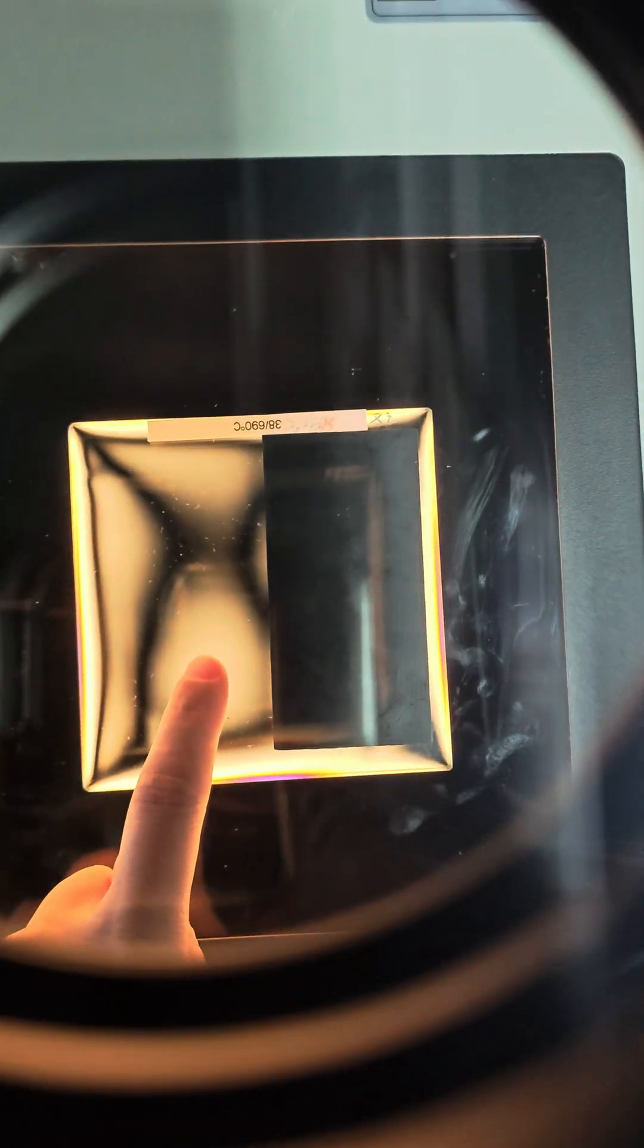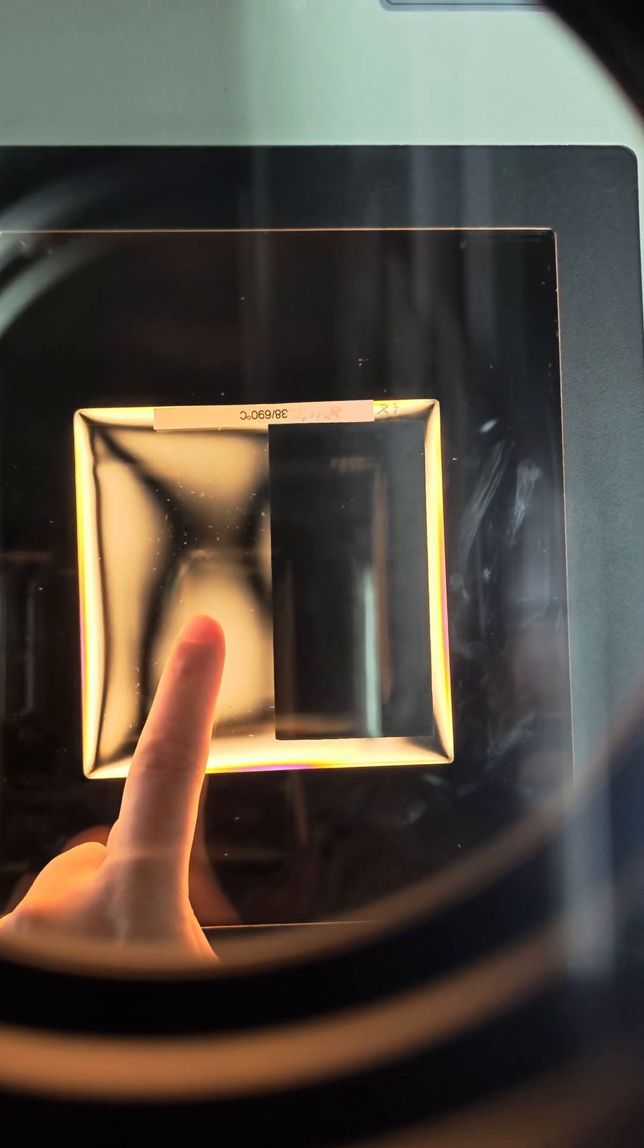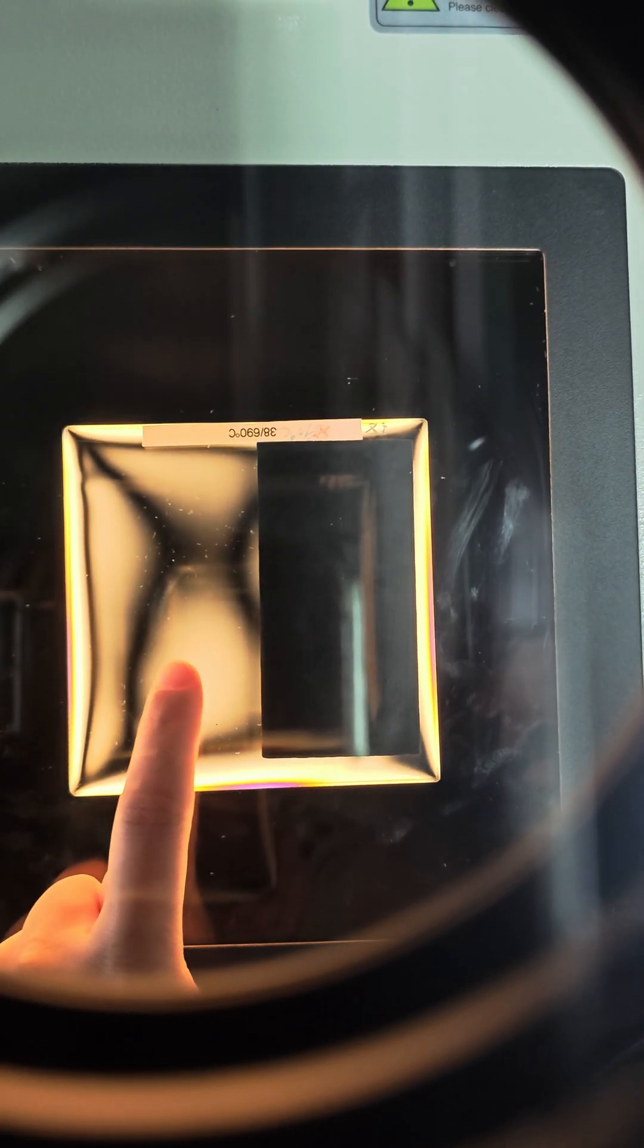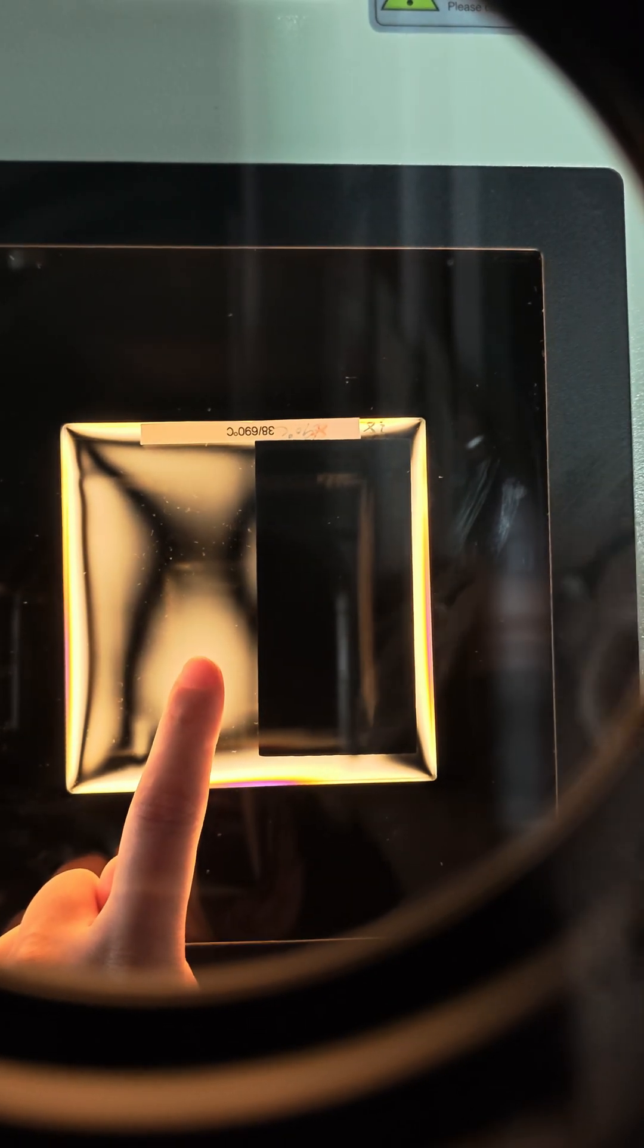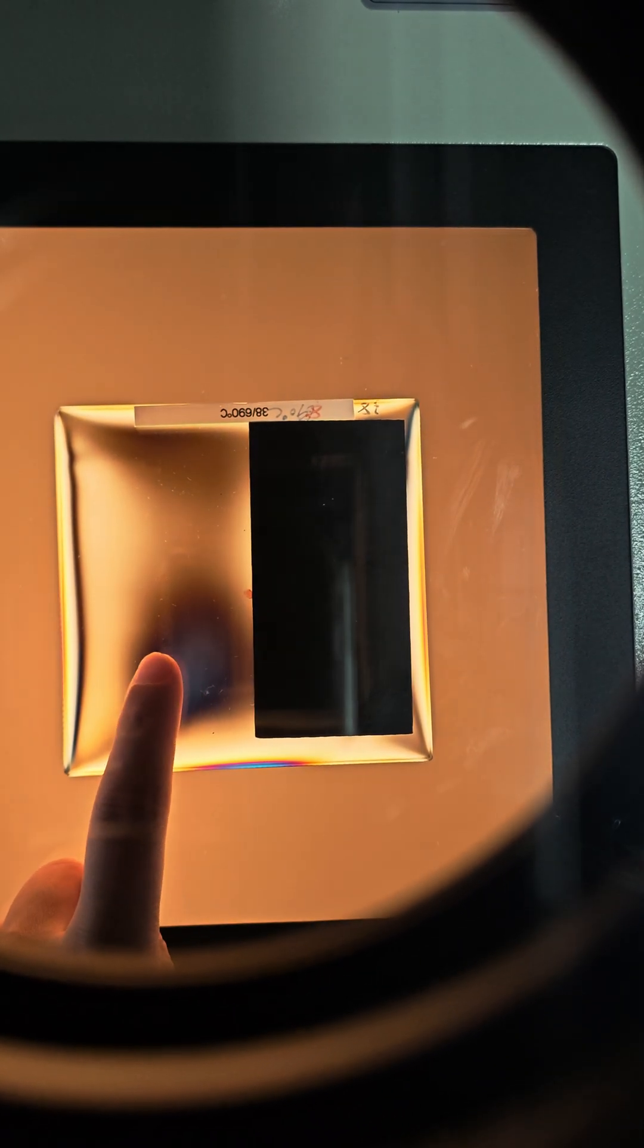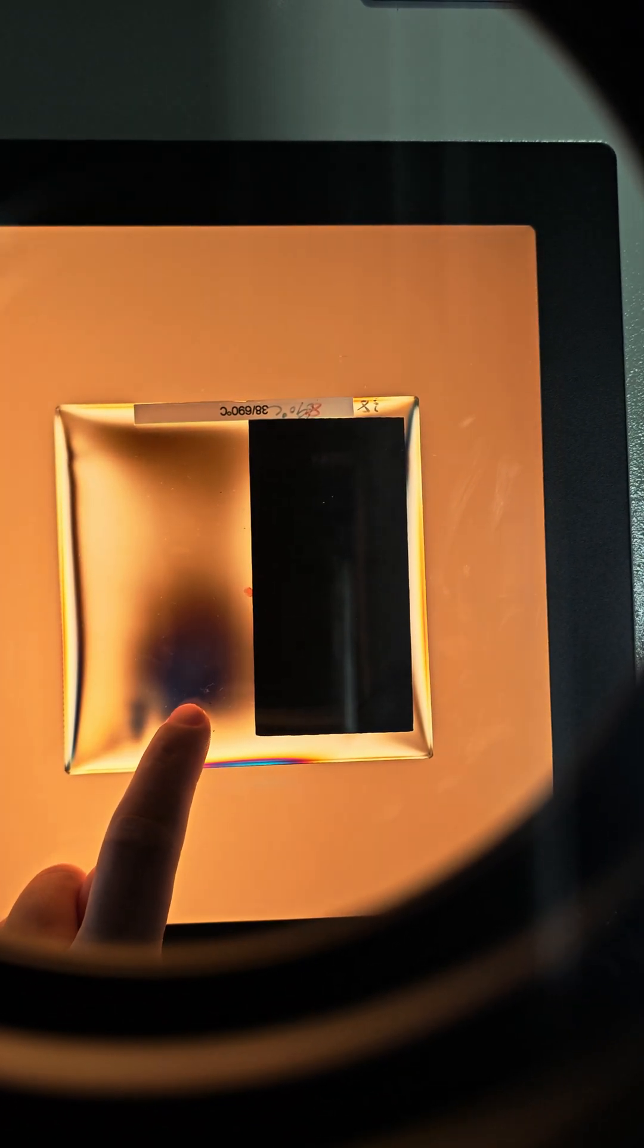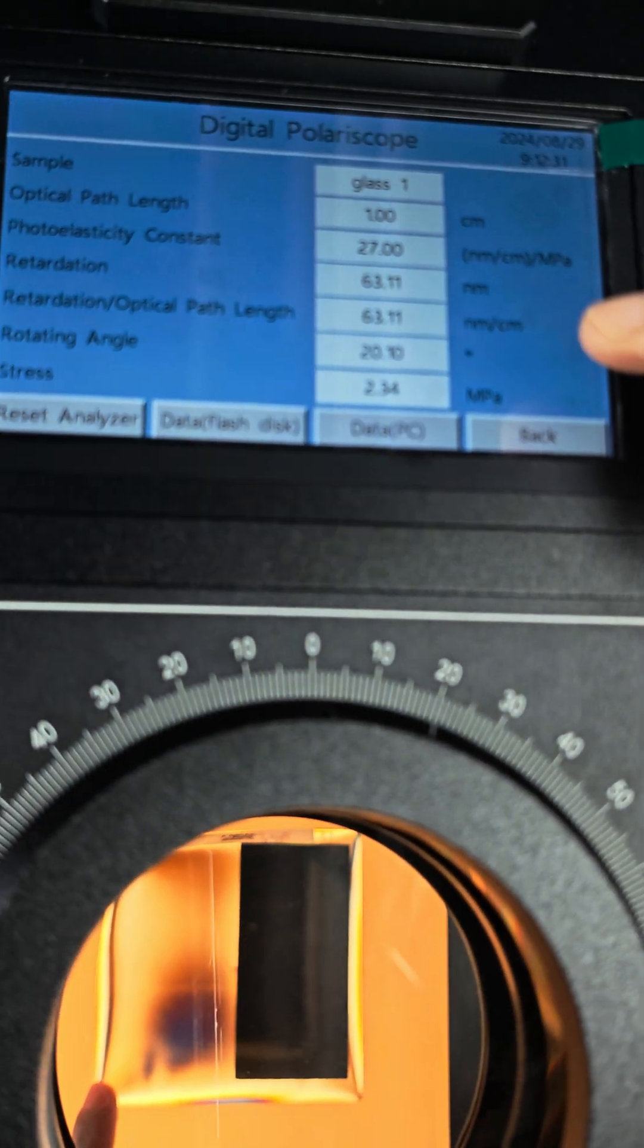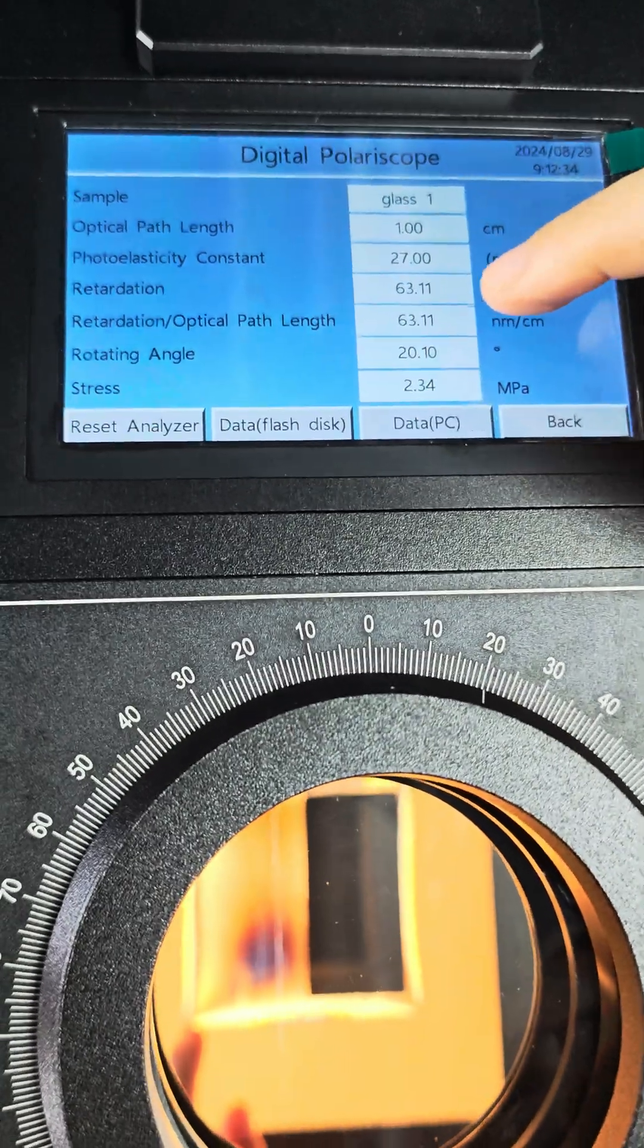Then slowly rotate the analyzer to make this selected area grow to the darkest. Now read the value on the screen.